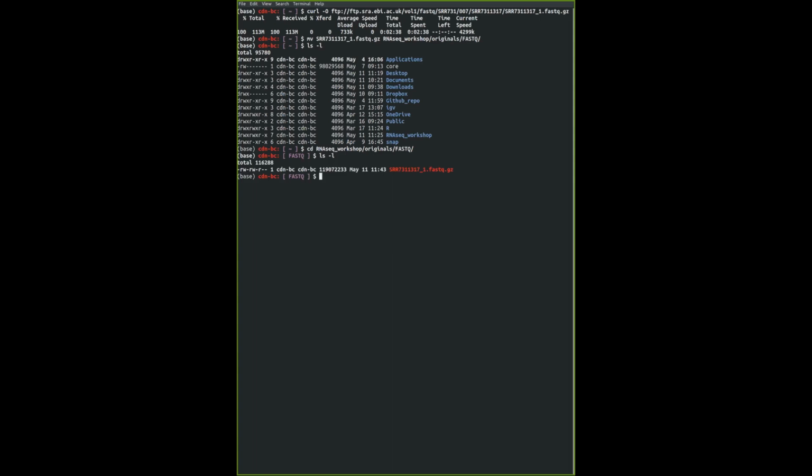Okay, I'm going to paste this set of code so that you can follow along in Etherpad if you're having problems. In there it's already CD'd into FASTQ first, followed by the downloading, so it's a bit easier. I made a mistake, so now we rectify the problem.